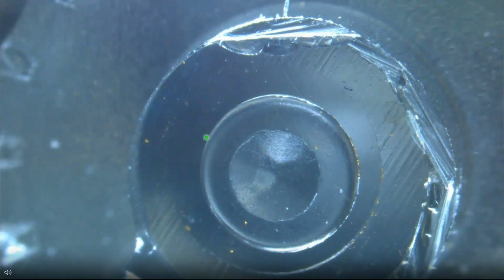And here you see a flow through chamber of the HPF in resin clamp with HM20. And when I switch off the fluorescence, you can see the worm appearing. Actually, this is the pharynx of the worm with a full front view by the mesa cut mirror.